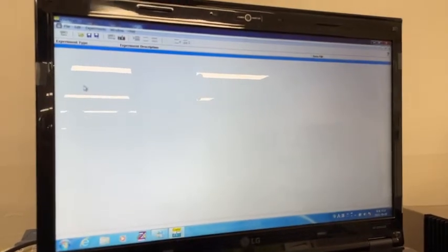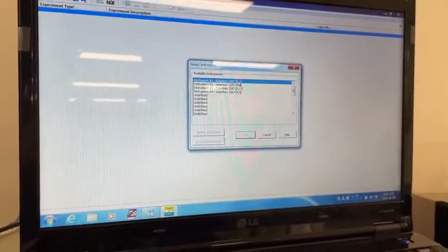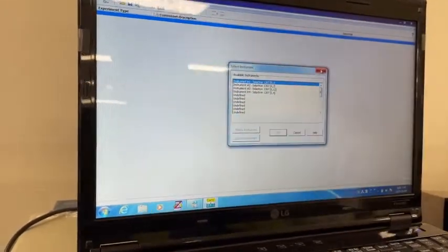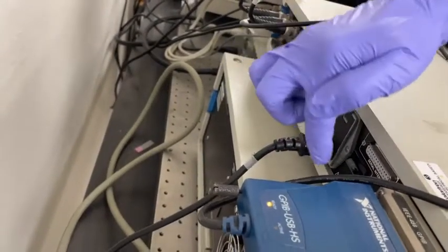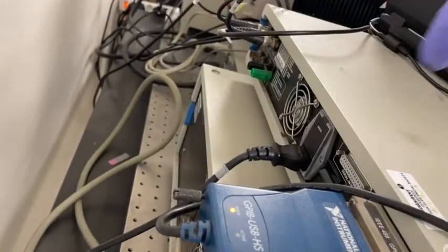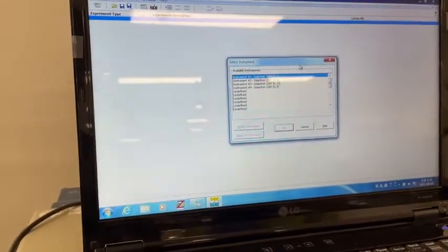Thank you. There is one more important thing that you need to remember, that whenever you start the CV measurement, you should never change the GPIB settings, because if you change the GPIB settings, then your system may not work well. And this GPIB setting is set by the backside keys. So here are the keys. If you change this key, then the setting of your equipment will be disturbed. So make sure that when you turn on and turn off the system, you should not touch the GPIB keys. So remember that this setting should not be changed. You need not change these default settings.